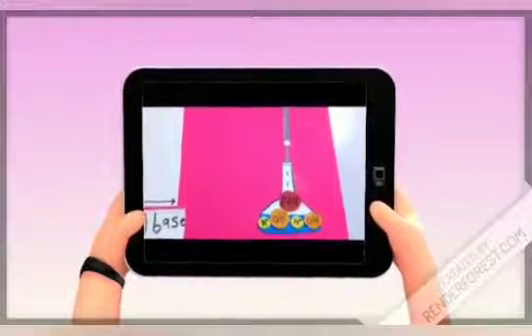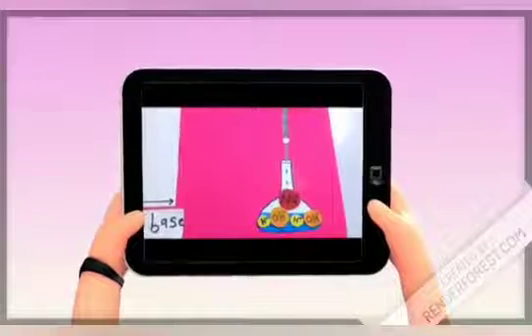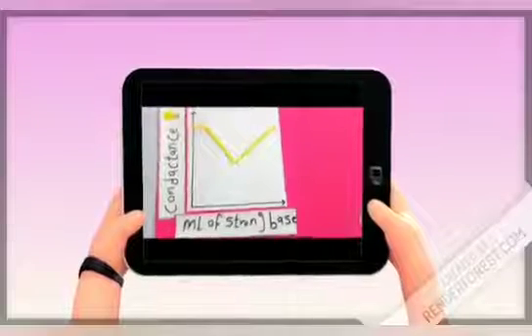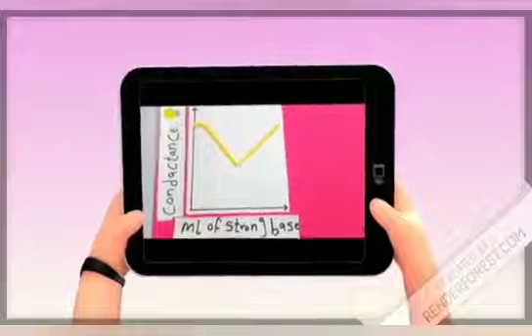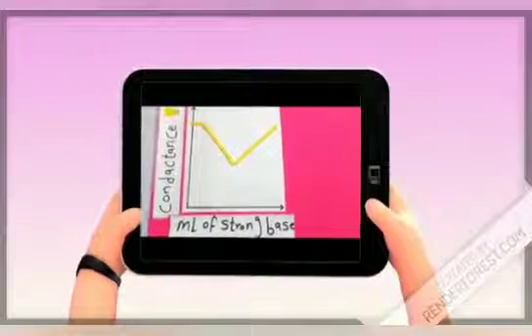Addition of excess sodium hydroxide to this solution increases the ionization and so increases the conductance. As you see in this titration curve, the conductance increases again due to high ionization of sodium hydroxide with the additive.